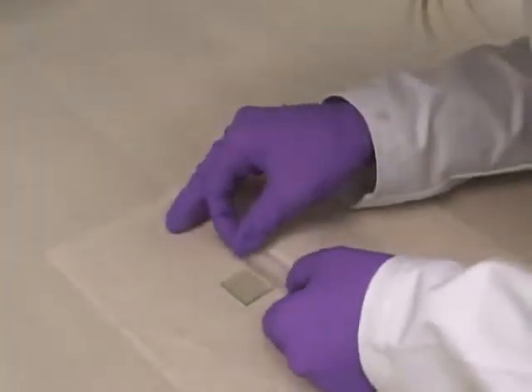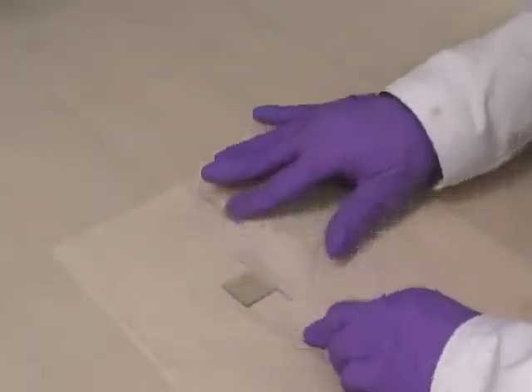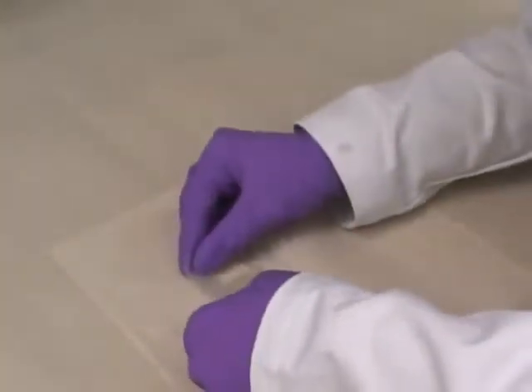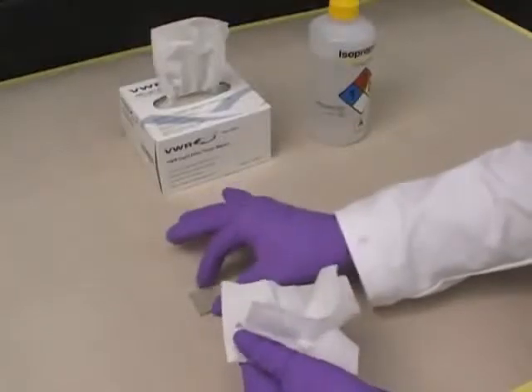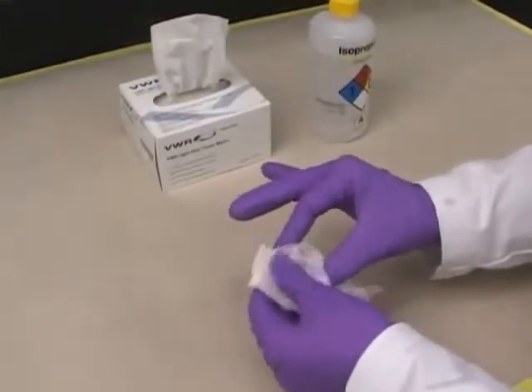Step 3: Use transparent tape to tape one glass slide down on the table on all four edges. The tape should cover roughly one millimeter of the slide on three of the edges and about four millimeters of the slide on the remaining edge. This tape has a controlled thickness and will form a 40 to 50 micron deep channel into which the titanium dioxide suspension can flow. Step 4: Use ethanol on a tissue to wipe off any fingerprints or oils on the slide.